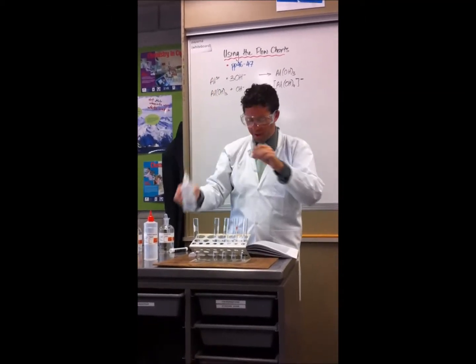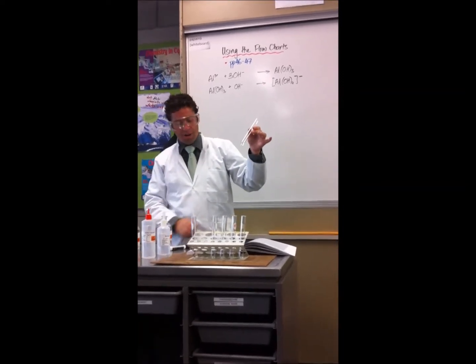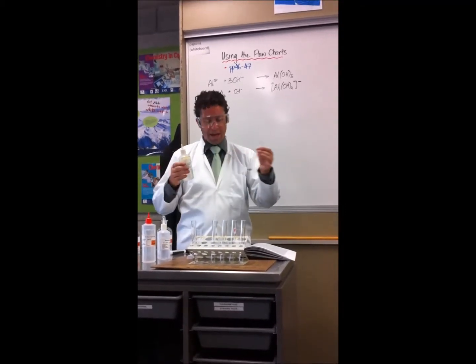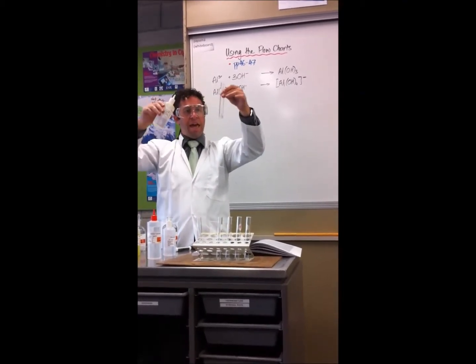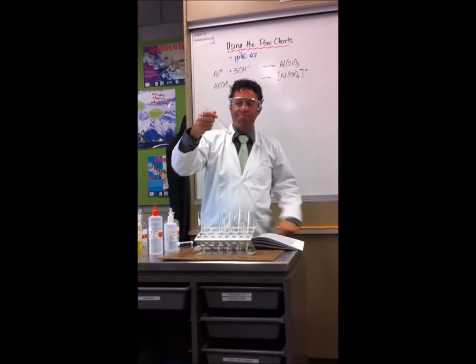And what I'm going to do with this one is add sodium iodide or potassium iodide, our next step in our flowchart. I'm going to use potassium iodide just because it's available. And again, it's just a few drops. Don't go hard on it. And if I shake that up, I can see nothing forms.